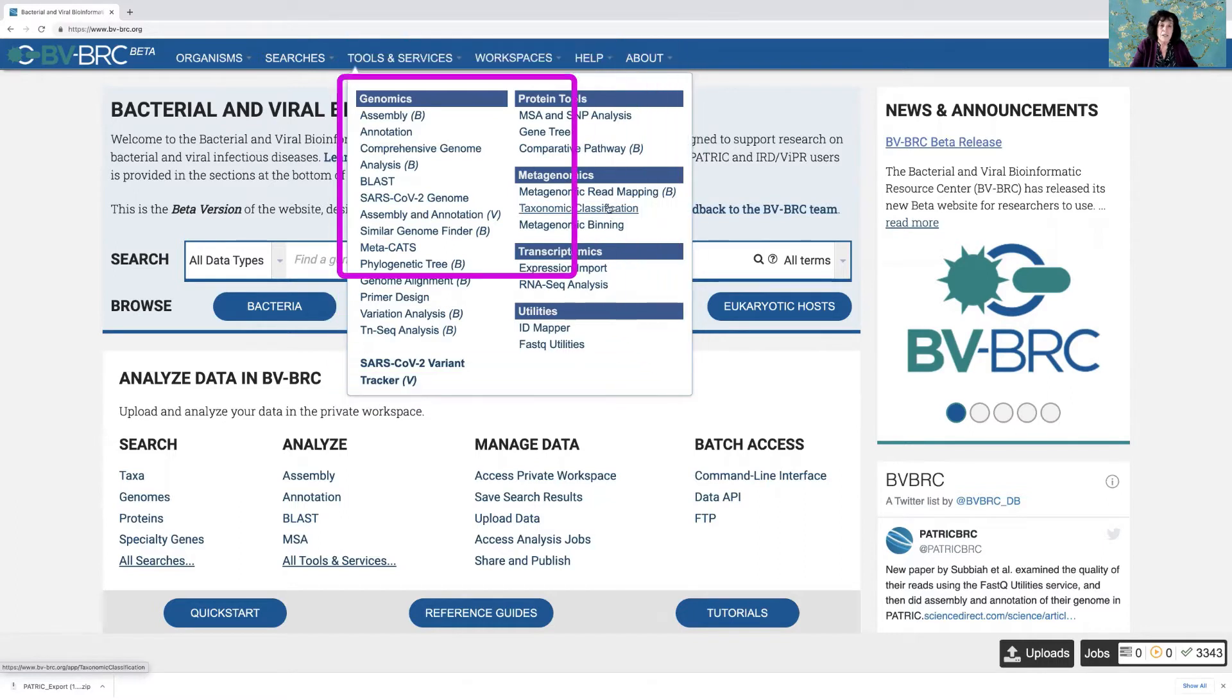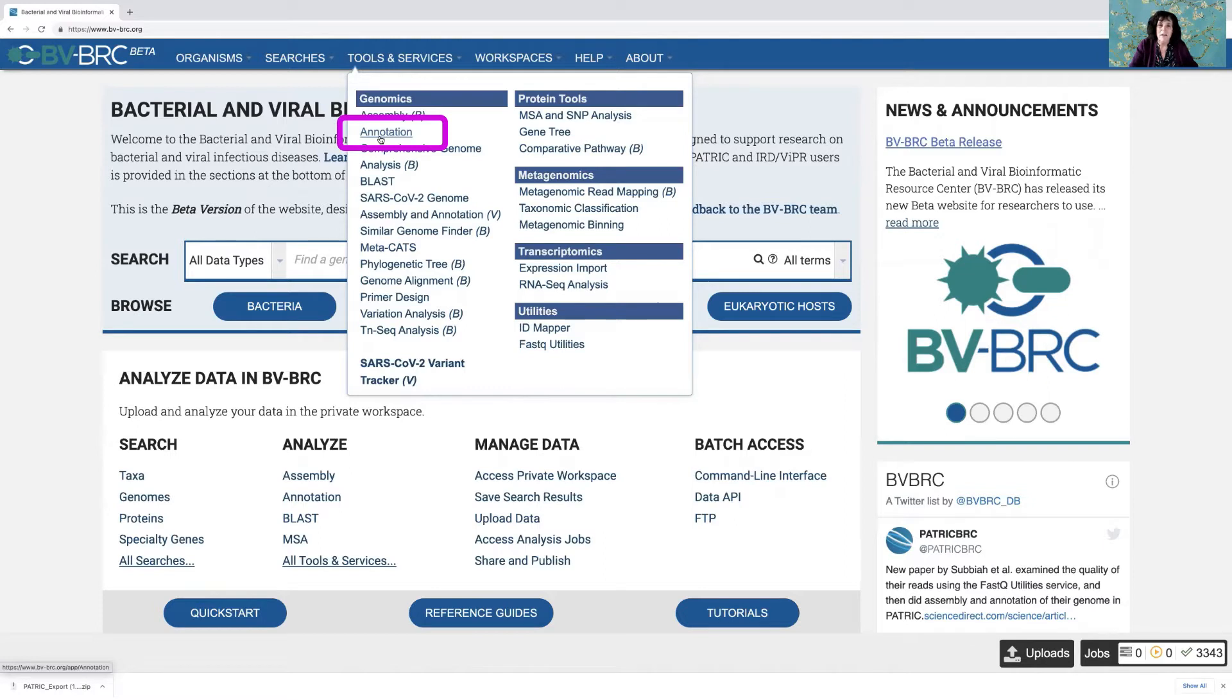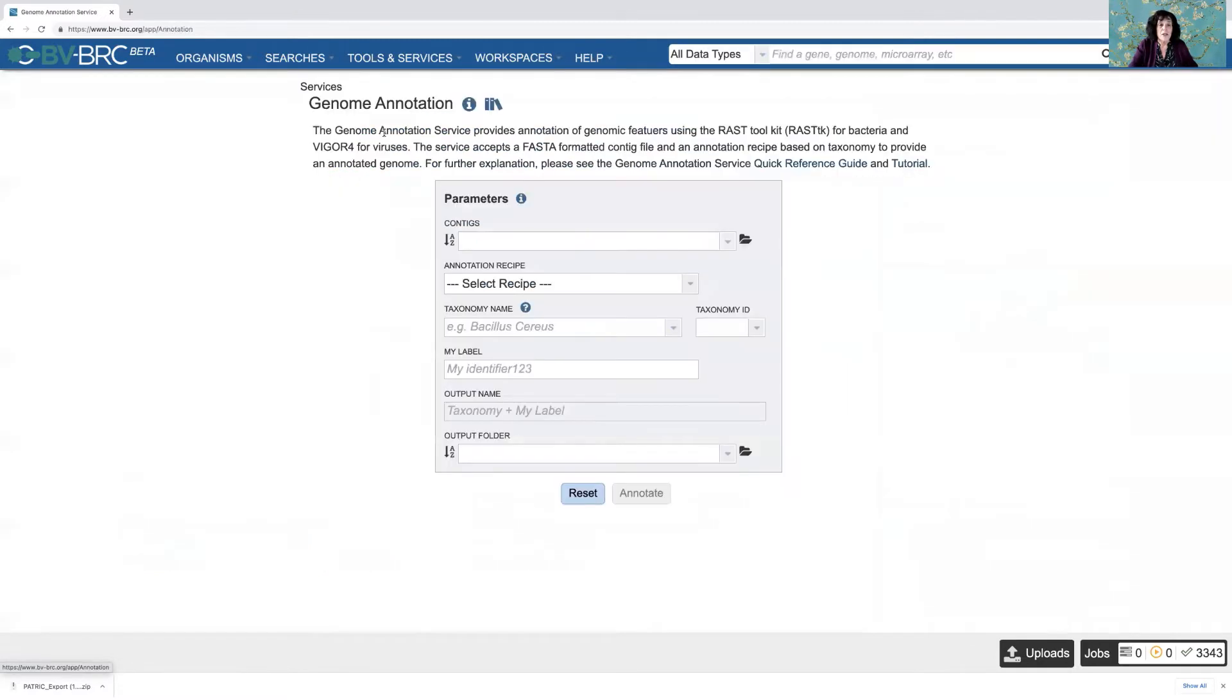So one of the things that we're known for is our annotation pipeline. So I thought I'd just show you how to launch one of those jobs. So I click on annotation and this is a hyperlink that will take me to the job landing page.